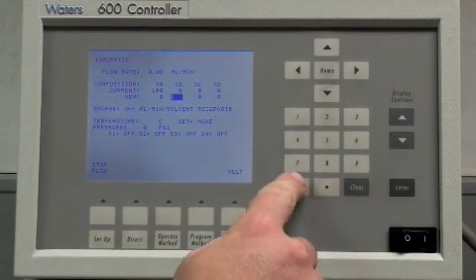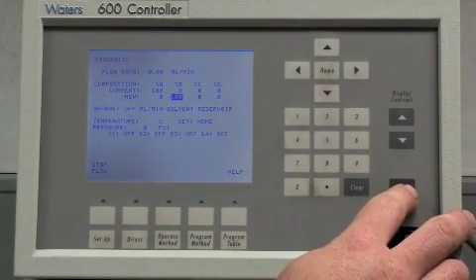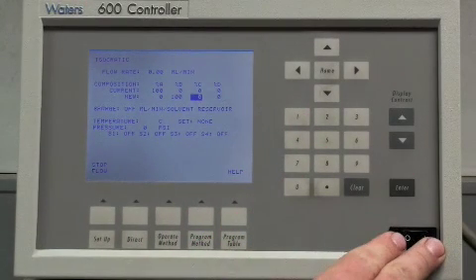On V, we're going to enter 100% and enter on that. Although the video doesn't show it at this point, you must continue pressing enter twice more for the change in channel to be accepted.